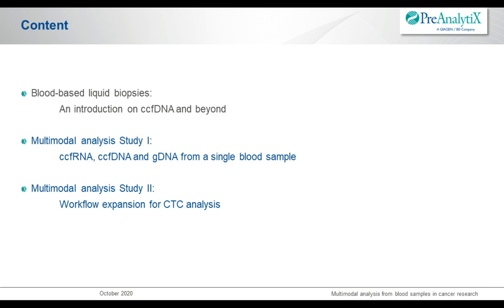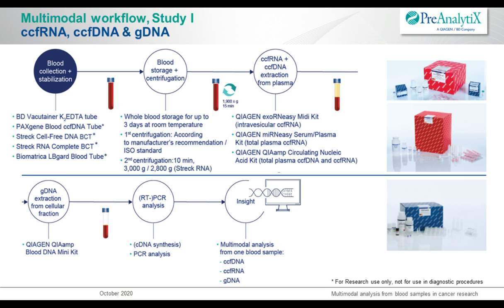Okay, so coming to the second part of my talk and to the first study that I want to show you with respect to multimodality. In this study, we looked into a workflow where besides ccfDNA, we wanted to show and to look whether other analytes from the liquid biopsy, which are important, can be isolated from the same blood sample.